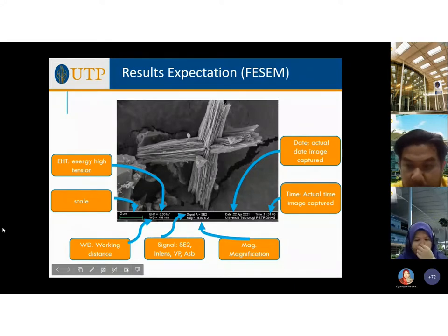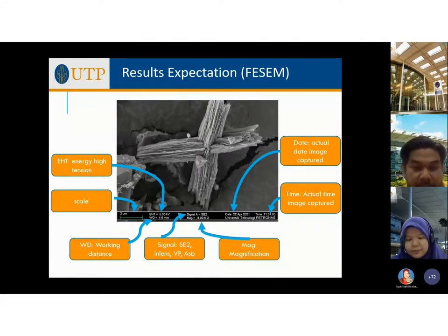Okay, thanks for staying for the video. Next is result expectation. Now it goes to FESEM, or also SEM.